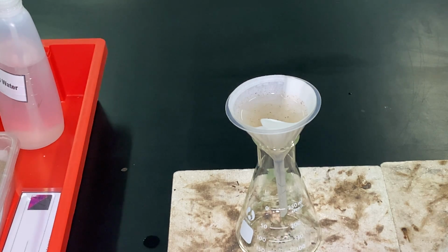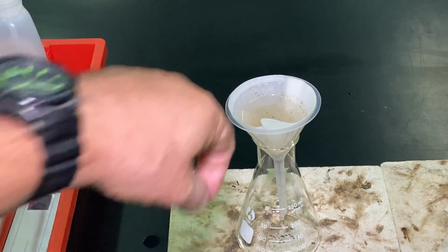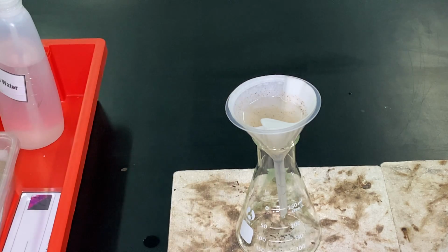So what we've got in the bottom here is the sodium chloride solution. Our sodium chloride is dissolved in water, and the insoluble sand, the large particles of sand, are going to be collected by the filter paper. So again, it's a physical process. We're separating two components of a mixture: the sodium chloride solution and the insoluble sand.